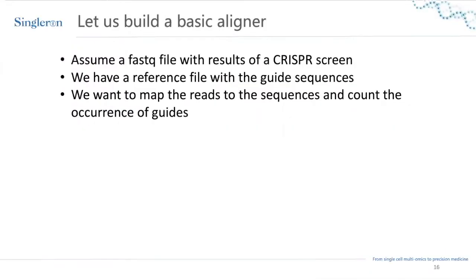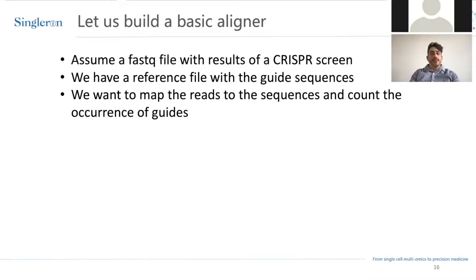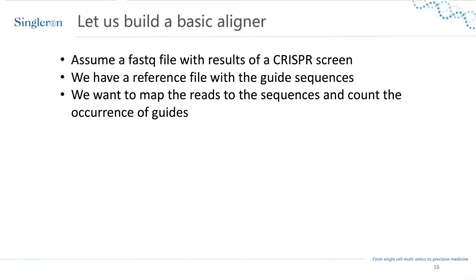So now, based on this, if you take the data of the barcode per cell and you take the UMIs, you can add them to the header of your FASTQ file, and now you can generate basic statistics. You can see how many cells you captured by counting your barcodes, and you can also see per barcode or per cell what the gene expression was by counting your UMIs.